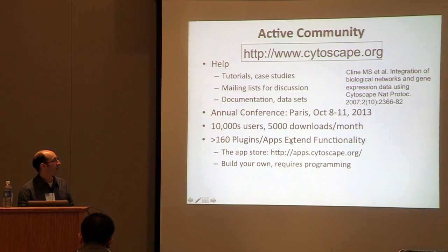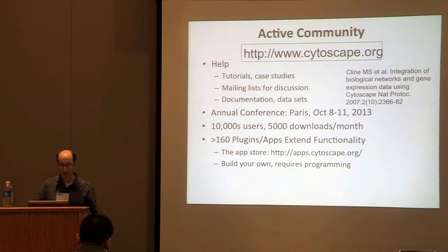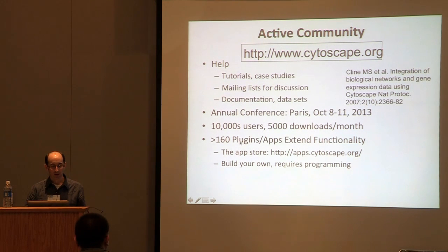Also, and probably the most powerful aspect of Cytoscape is that the functionality of Cytoscape is extendable using plugins or apps. We used to call them plugins, now we call them apps, because people liked apps better. So now we have an app store at apps.cytoscape.org. There are over 160 now, and they do all sorts of things, which I'll talk about in a bit.